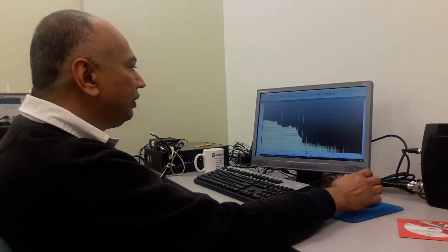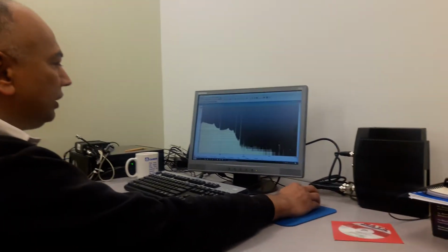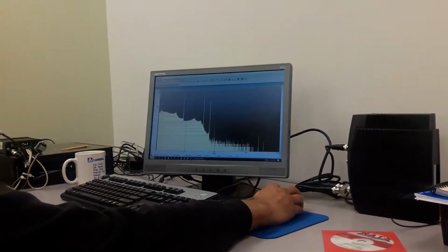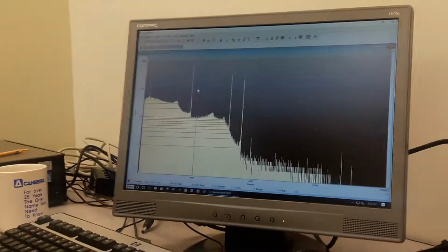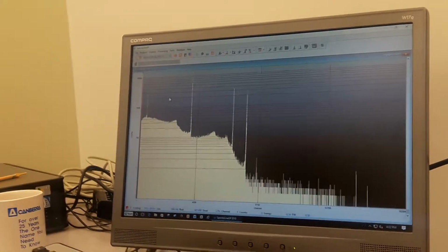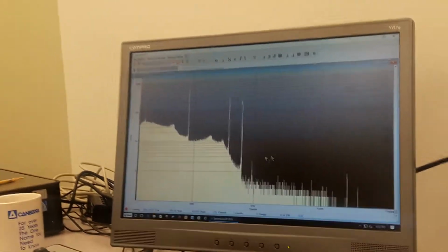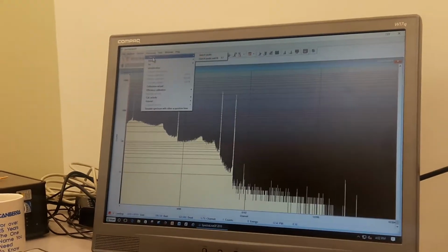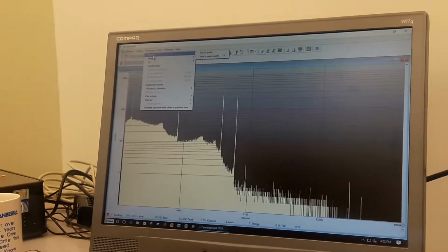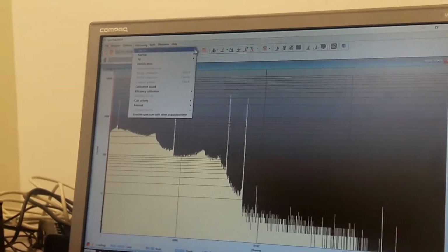And now we have collected the spectrum, and at this point we can see the spectrum has finished collection. What I'm going to do is go ahead and conduct what we call a peak locate and a peak fitting. Which means that I will identify all my relevant, statistically valid peaks in here, and I do this by going to my processing, and I go to peak search and I do a search with a fit.